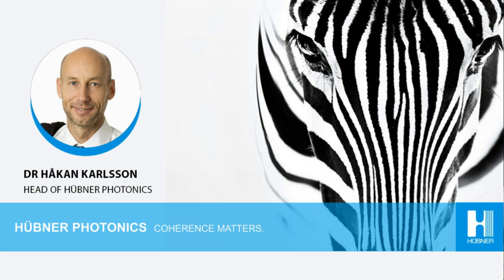So this question touches on something that I think Teresa mentioned briefly. Are your lasers semiconductor laser diodes? Yes. In a way, yes, and that's it. But more complicated, we can say yes. There is a diode laser in all our lasers.